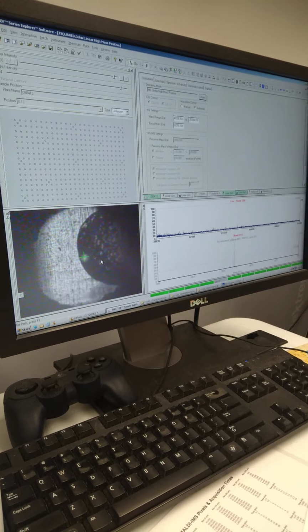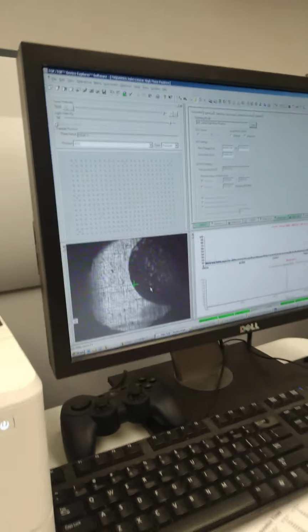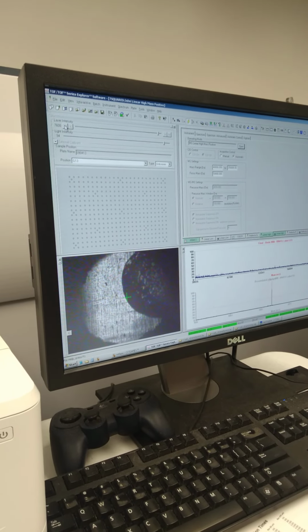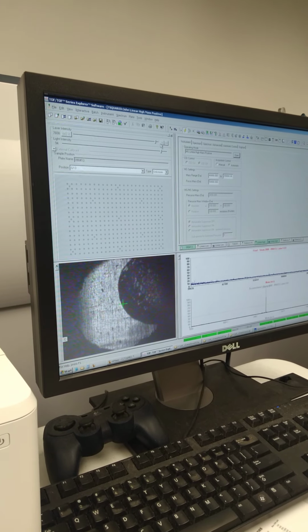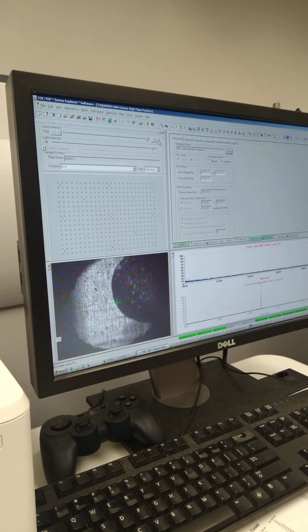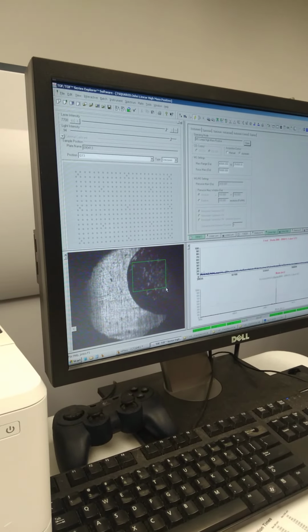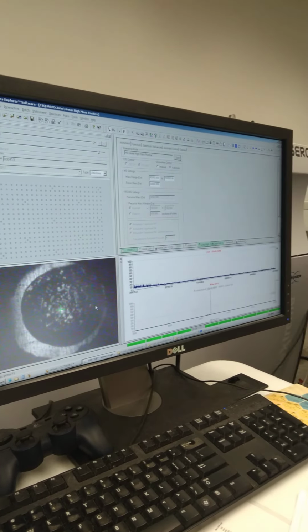All right, so it's firing the laser. And we're already up, so you can try moving the laser intensity. That would go up. I think we're basically at the max laser power I would use, but go up, use a double arrow, and that will raise it at 100 at a time. So let's go up to 77, and let's fire again. So once you click around and go over to the other side of the spot, double left click, and you can do that one, and then double left click and kind of walk around. Let's see if we see anything.